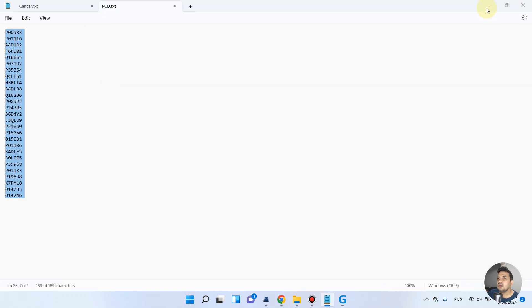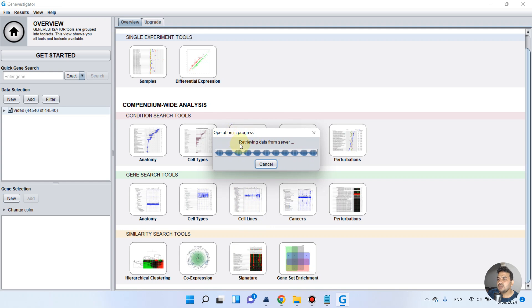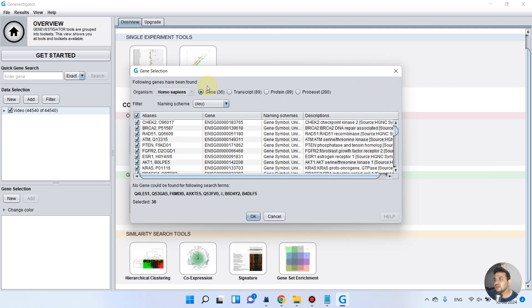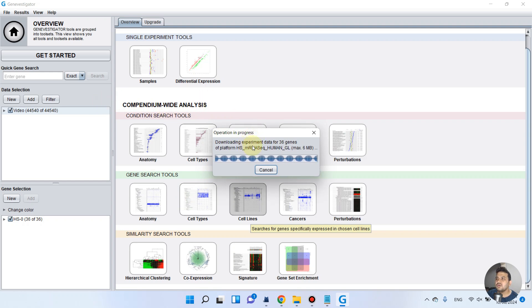We have another set from programmed cell death, giving us a total of 48 genes. We click OK and it starts to retrieve data for these 48 genes from the selected database. As you can see, it shows an error that it could only identify data for 36 genes out of the 48 entered. That's okay — we can use these 36. It is now downloading the experiment data for those 36 genes from the selected database.